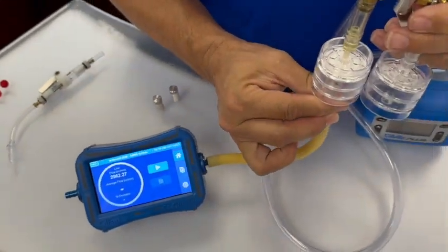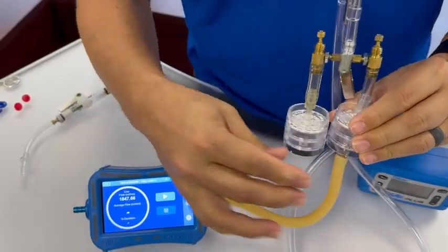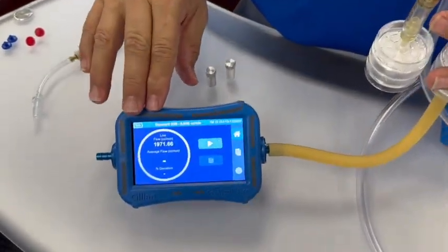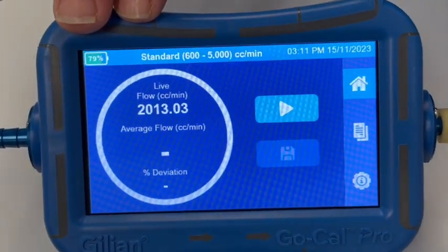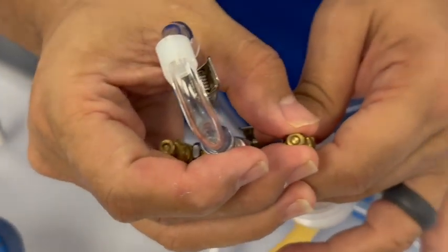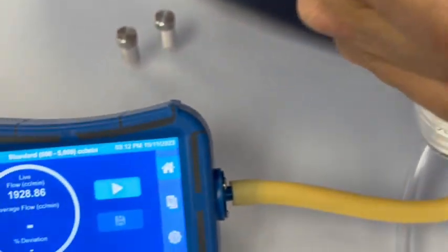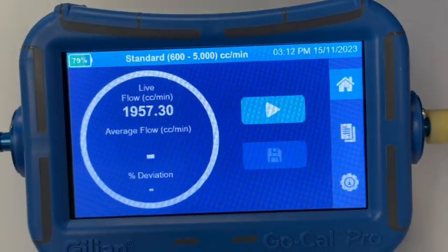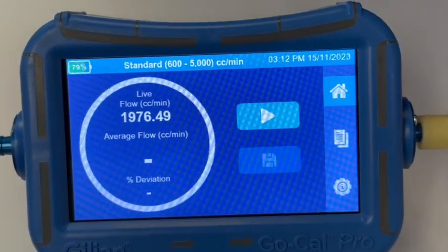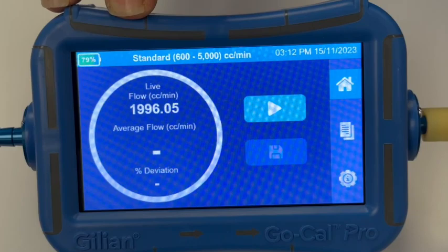Once we get to the desired flow rate, we can disconnect the tubing from the filter and move it to the second and opposite side of the manifold. Again, we look at our live flow readings on our flow meter and make fine or rough adjustments to get it close to our desired flow rate.